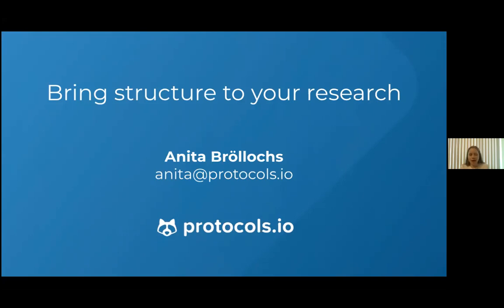And for that, we do have this option to create what we call a protocol collection. So you can create a protocol collection where you can put in different individual protocols, bundled up together in this one collection. I hope that answers the question.